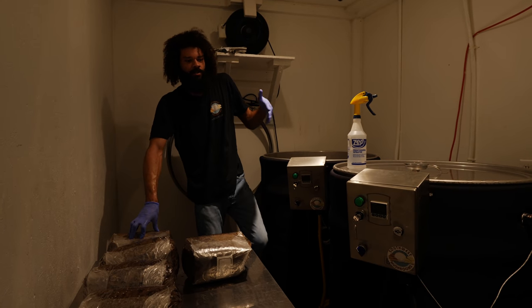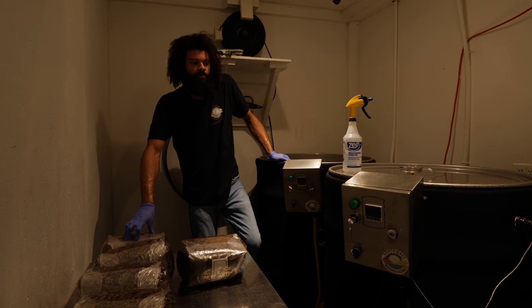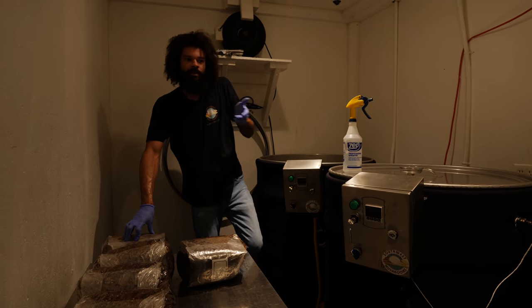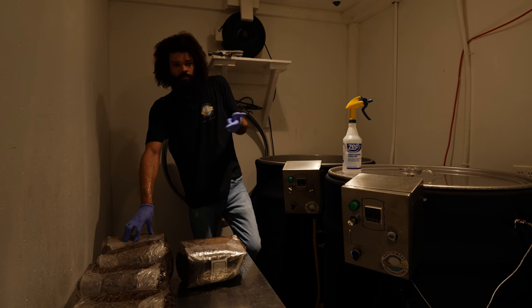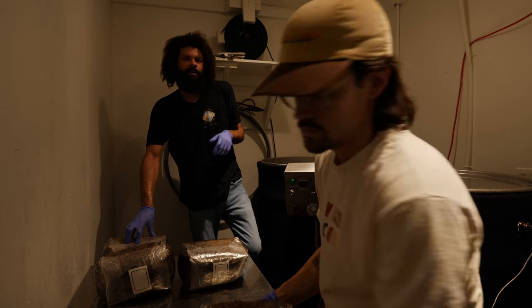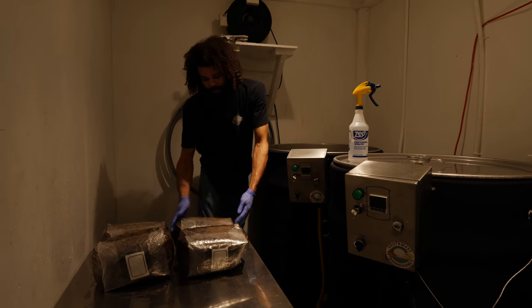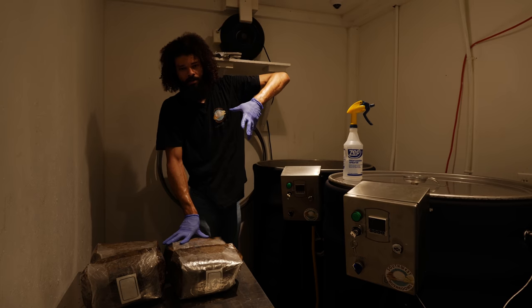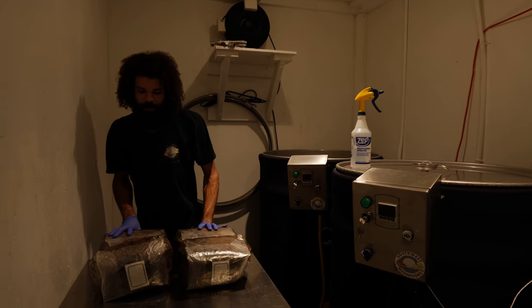At one point they would cool in the lab, and I still do that. I have two sets of sterilizers now, so these ones remain right here for the time being — I'll eventually put some wheels on them. I'll unload these out here, let them cool, and then I have a second set on wheels that I can wheel into the lab. I can unload those sterilizers when the blocks are at a hotter temperature, because they're just going to be cooling down in a really clean environment. If I wanted to, I could unload hot blocks in this room and put them in the lab, and I wouldn't have any issues — I've had to do that before.